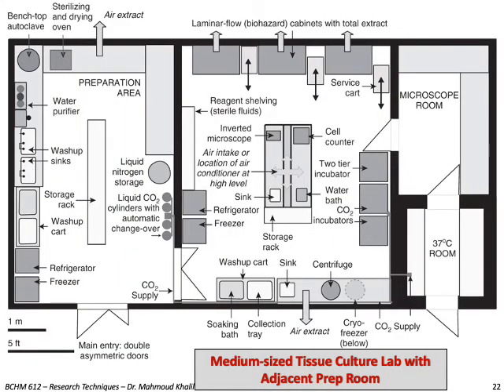Here you can see the design for a medium-sized tissue culture lab with adjacent preparatory area. And you can see that the preparation area is separated from the cell culture lab, with all the equipment needed for sterilization and preparation of chemicals.